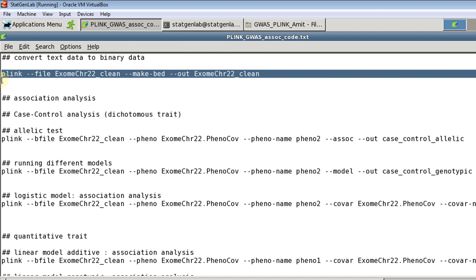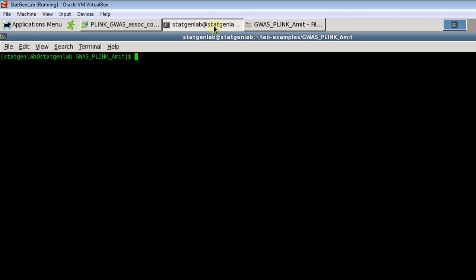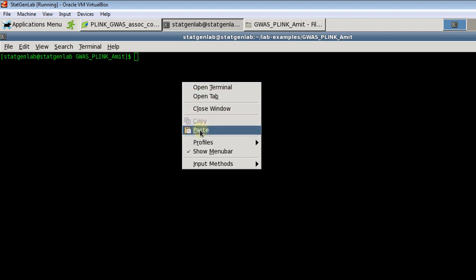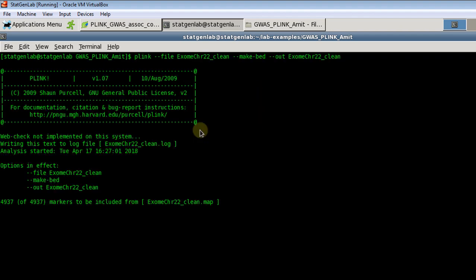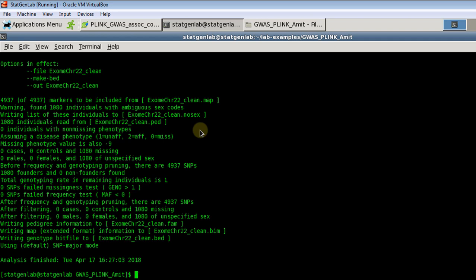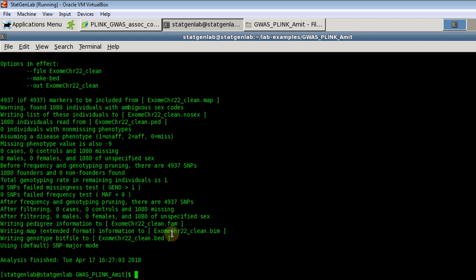So to convert that I am going to use minus minus make bed option and I am keeping the same file name as map and ped but it will have different extensions. So it converted data into binary format and here are our three different files that it created: the same file name but the extensions are dot fam, dot bim and dot bed. So for further analysis we are going to use these binary format files.